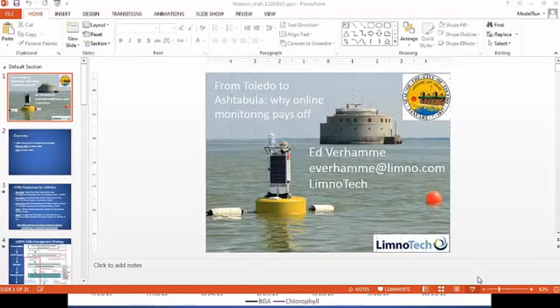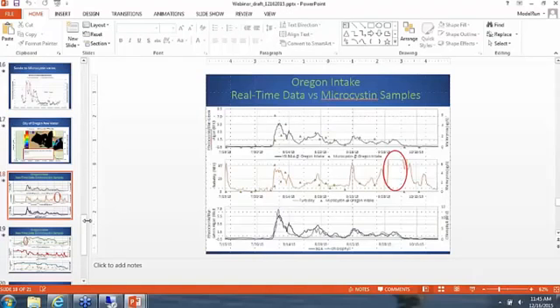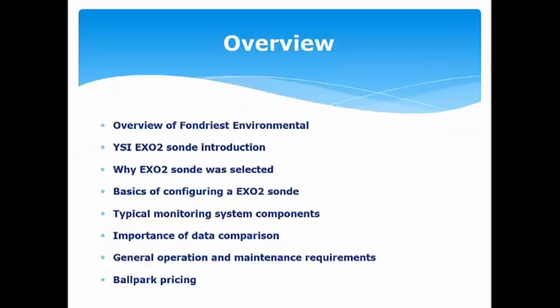Thanks, Ed. Good morning, everyone. What I want to get into is a bit more about the instruments being used in the Lake Erie network specifically and throughout Ohio. You can see an overview of what I'll be talking about here this morning. I'll talk briefly about the company, get into the YSI EXO2 sondes that are being used, basics of configuring, and get into some of the pricing as well.